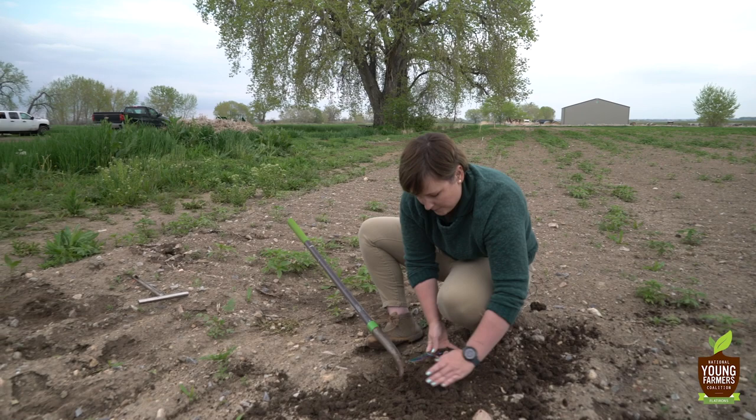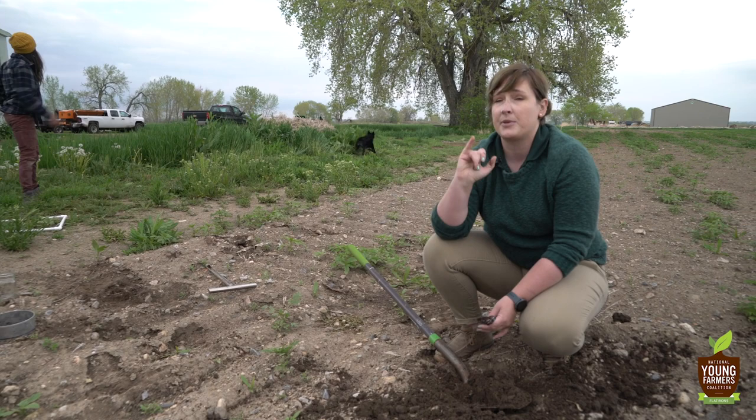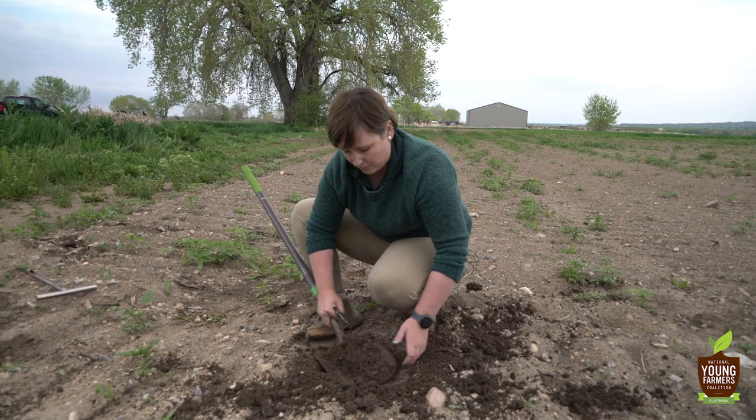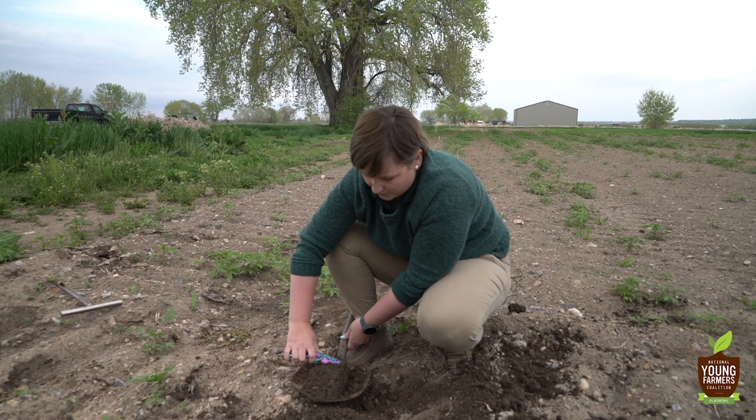If I'm doing a lot of sampling, on my probe I will usually mark with a piece of masking tape, the bottom of the masking tape being the depth that I want. I'll stick my probe into that depth and then pull it out. You can do the same on a shovel. They do tend to wear off if you're doing a lot of sampling, and you will typically have to replace them partway through. Or you can just measure.